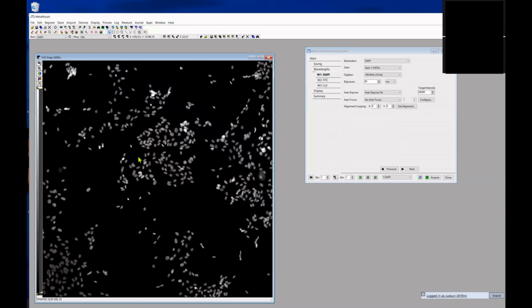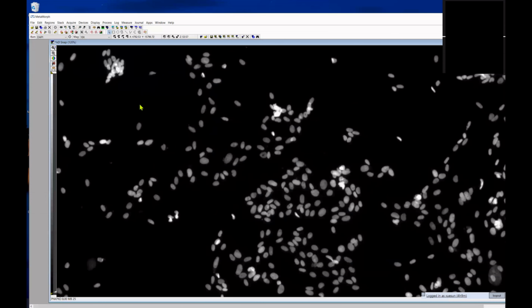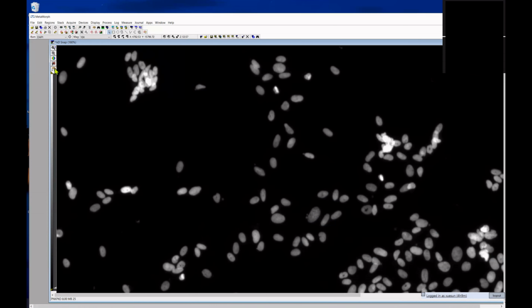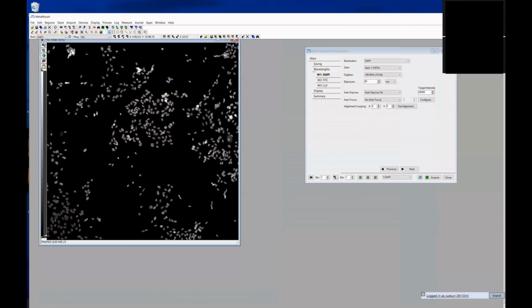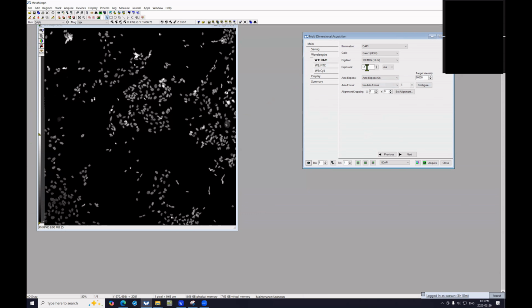It is important to keep in mind that we are using a 16-bit camera. 16-bit means for every pixel in this image, the computer allocates a certain amount of memory or binary units. Every pixel can encode information for 16 zeros and ones and thus resolve a wider variety of intensities. In other words, the dynamic range of a pixel can vary from 0 to 65,535 in a 16-bit image. Thus, if you target your exposure to 50,000, you have some room before saturation and are able to capture and compare images of varying intensities. In this case, the exposure time would be 13 milliseconds.